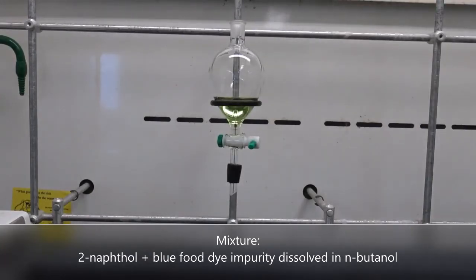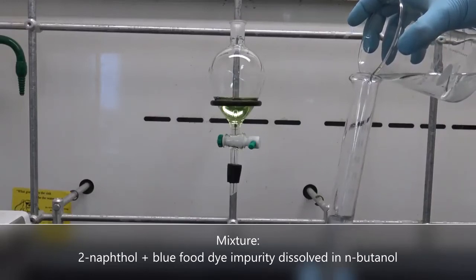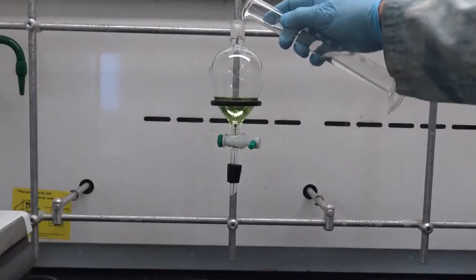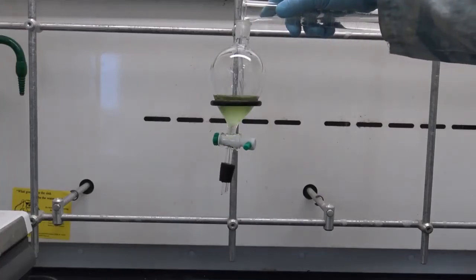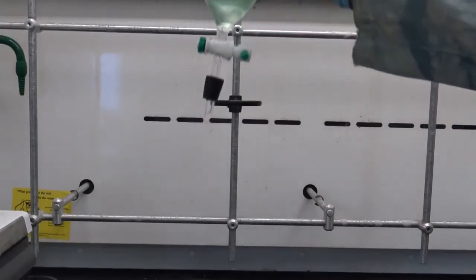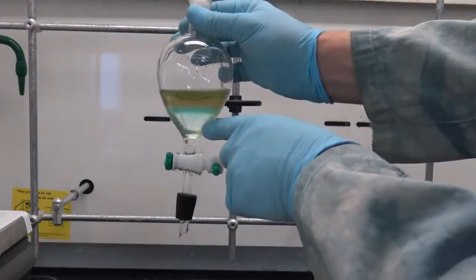The next step in the process is to give my impurities somewhere else to go. So I'm going to give it 50 milliliters of water, a solvent in which the blue food dye is far more soluble than in butanol, but the 2-naphthol is not. I'll gently pour that in, which isn't really a requirement of the procedure, but I'm hoping to show you the process as it happens, so I'm going to be very delicate with this as I go. Now you'll probably notice that once I've added that water, I haven't really changed much. I still have sort of a green solution of naphthol floating above water because the density of the butanol solvent is lower.